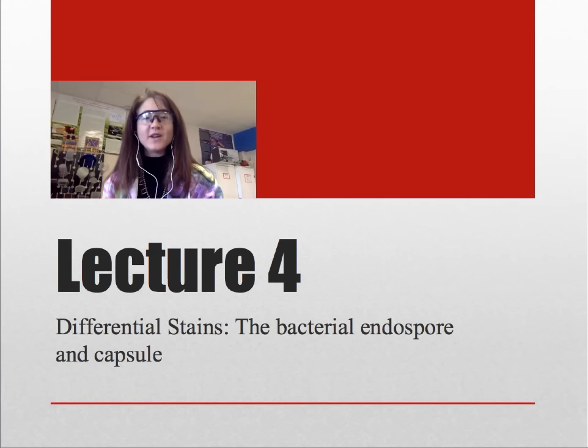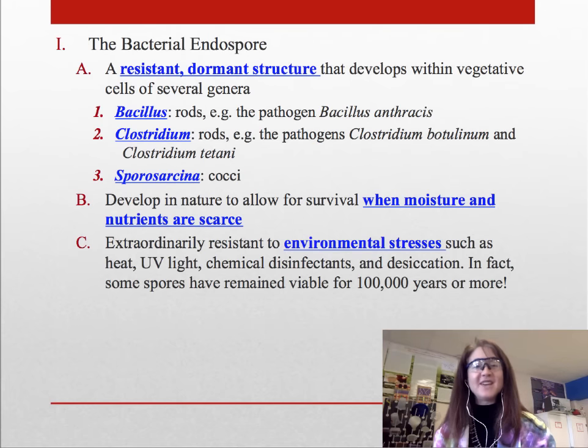Now we're also going to show you a sample flagella stain. So be sure to find your way to the back of the room by the windows to see that example microscope with the flagella stain today. However, you will be performing the endospore stain and the capsule stain. So let's get jazzed for those and talk a bit about the background, beginning with an endospore.